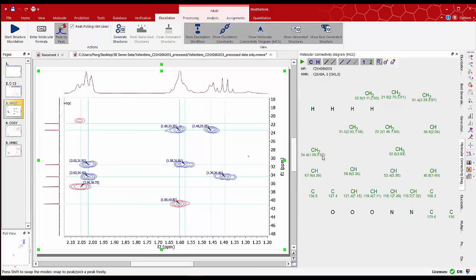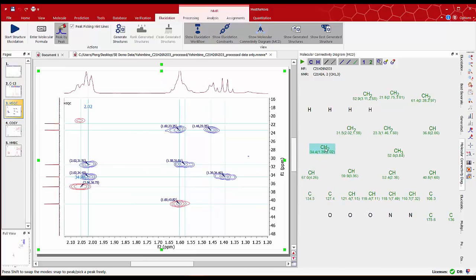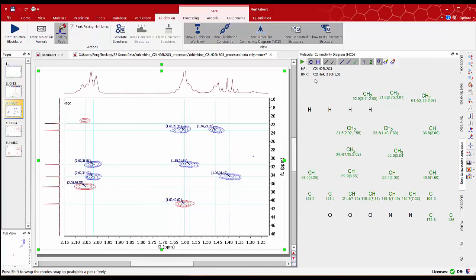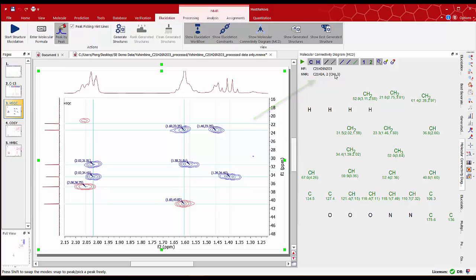Once correlations are picked we can see how the MCD diagram says that we have 21 carbon atoms and 24 protons. It is also indicating that MNOVA is not sure if 2 atom groups or 2 HSQC peaks are CHs or CH3.